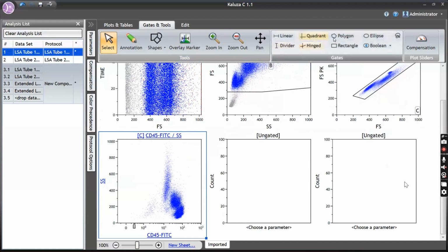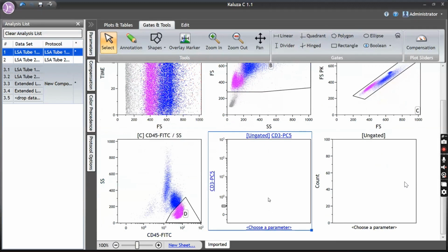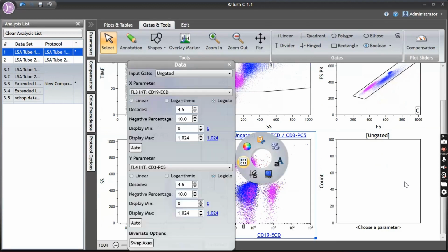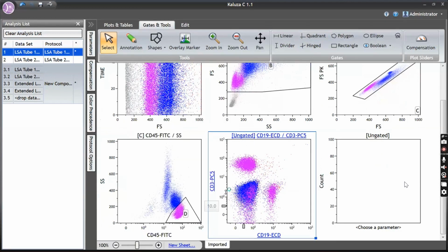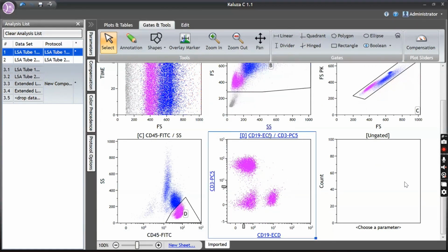population. Now I'll get the lymphocytes. Okay, so now I'm getting the lymphocytes because my population of interest for further analysis is only this, not monocytes or neutrophils. So now I need to check with CD3 versus CD19. Okay. Now I'm going to put only the lymphocyte population. Right?